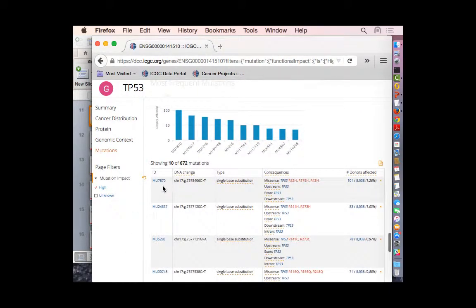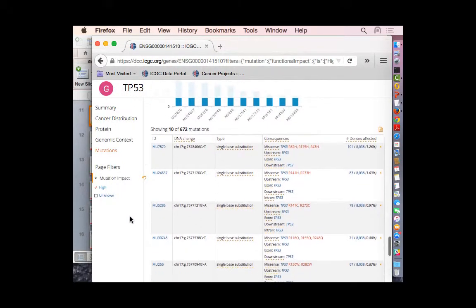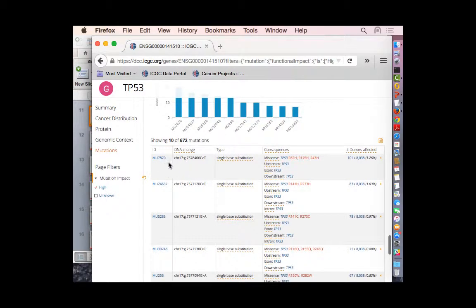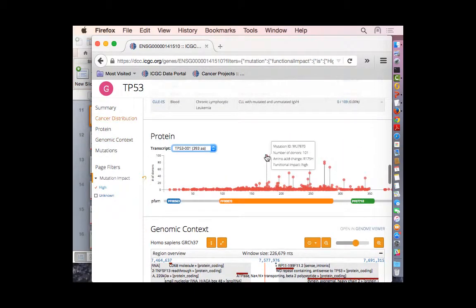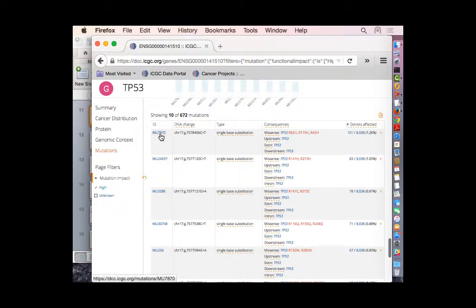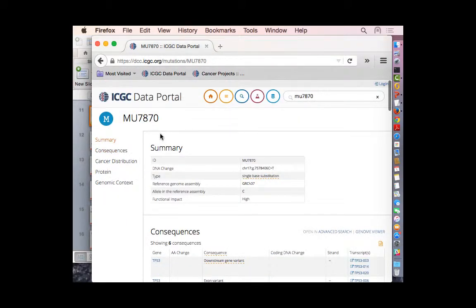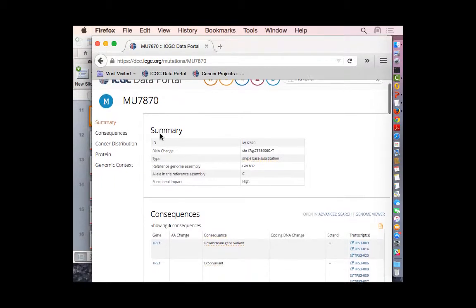Down here are the most frequent mutations listed within this gene. I'm going to click on this mutation to see more detail. All the annotations and data are based on the same genome reference — in this case hg19, which is older than the current one. We don't have a plan right away to move to the new one, but it should happen at some point. All the mutations and annotations were based on hg19.